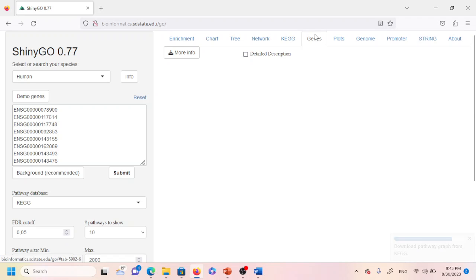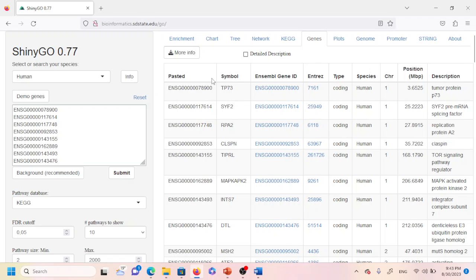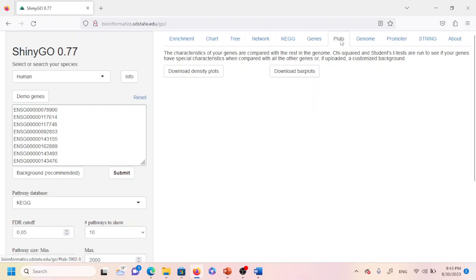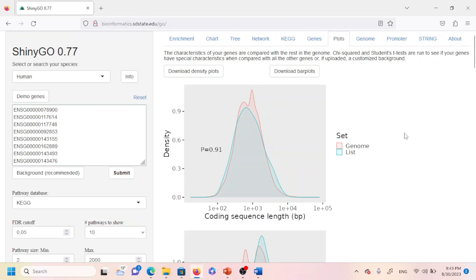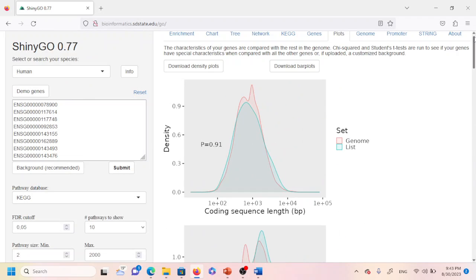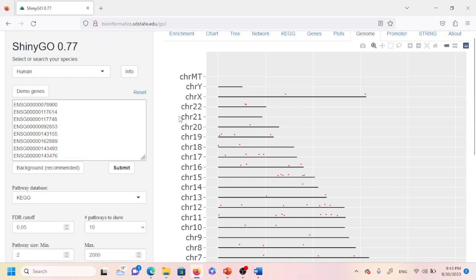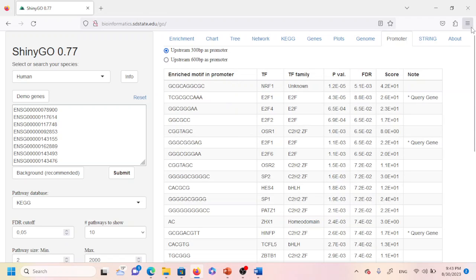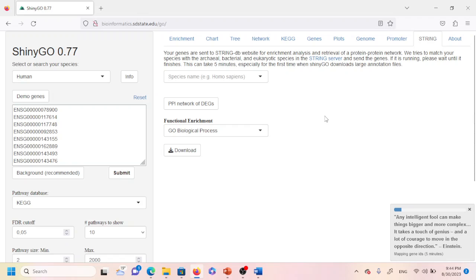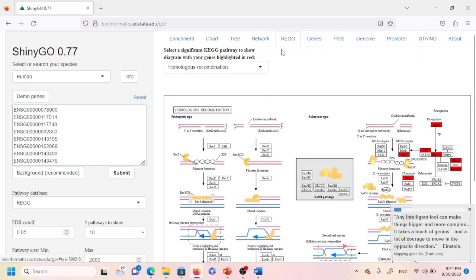While waiting, you can click on 'Genes' to see the different genes that are associated with the pathways. You can also click on 'Plots' to visualize different kinds of plots such as a density plot and bar plot. Under 'Genome', you can find out where a particular gene is located — which chromosome and position will be highlighted. Under 'Promoter', you can see which promoter sequences are enriched. And under 'String', you can visualize the protein–protein interaction network, though this may also take some time.